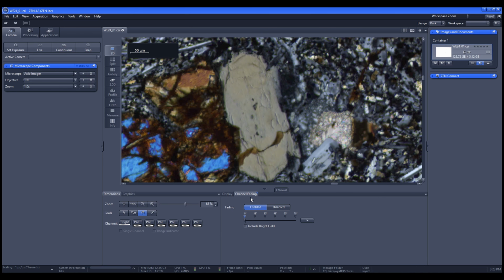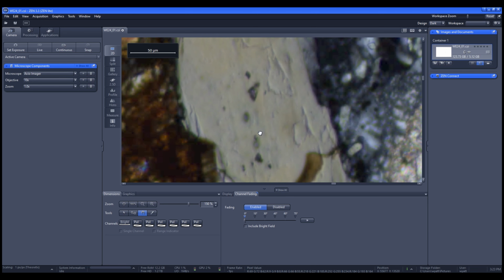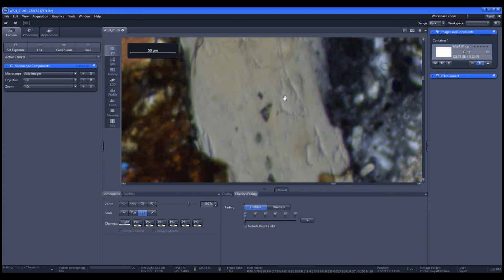We're looking at the side view of the crystal, which means we are looking down, I believe, what is called the A-axis. We're essentially looking down the side axis of the mineral. We're not looking down the long axis. If we were looking straight down from point to point, basically the top of the mineral, this would be the C-axis. This would be what is known as the optic axis of the mineral. And since we're looking down the A-axis, the side axis, we're only going to probably see one zone of cleavage. Kind of hard to tell if even this one.